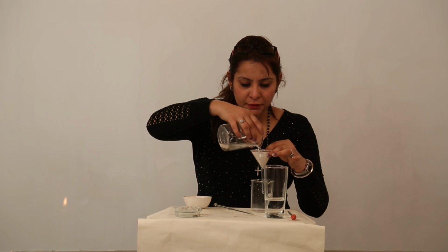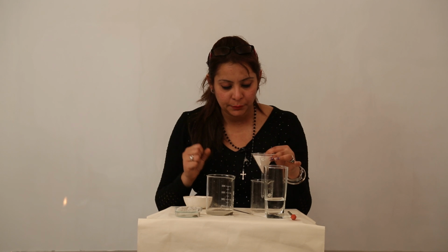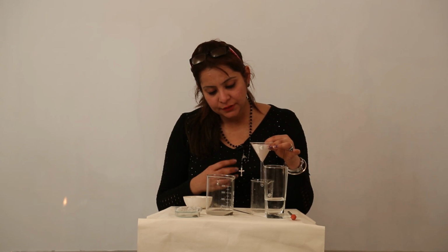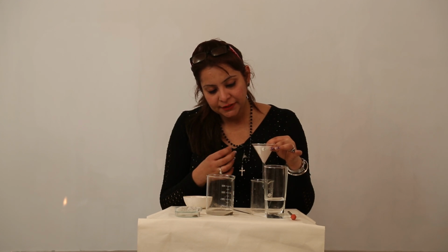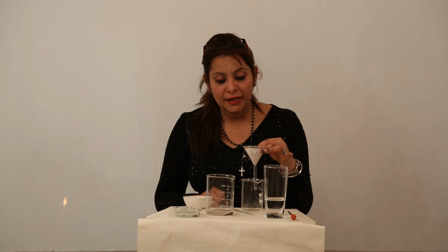So what is going to happen? The salt particles form a true solution, and we know a true solution always passes through filter paper. They are not stopped by the pores of the filter paper. So we are separating it, and what we get to see is that the sand is being separated, and the filtrate is collecting in this beaker. This filtrate is not pure water, it is a salt solution, because the salt particles pass through the pores of the filter paper, as they are too small to get separated.